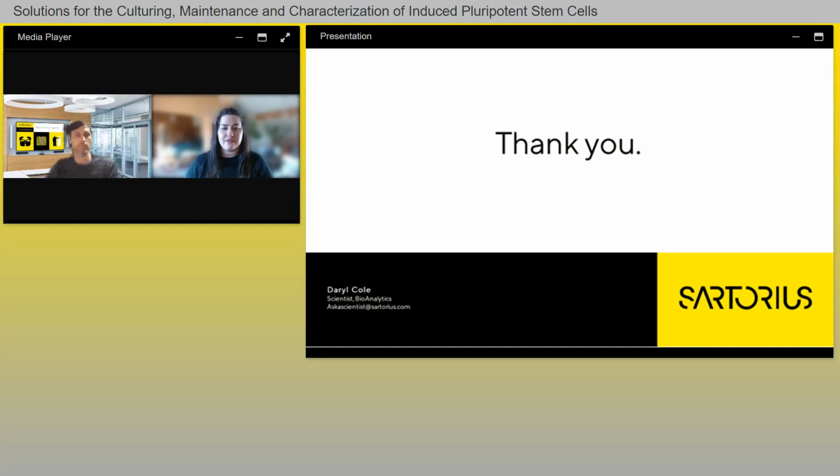Great, thank you. Our next question asks, how is the iQue different from a standard flow cytometer? One of the main differences is the way that it actually processes the samples. It uses an air gap solution, so it can more quickly process your 96 well plates.